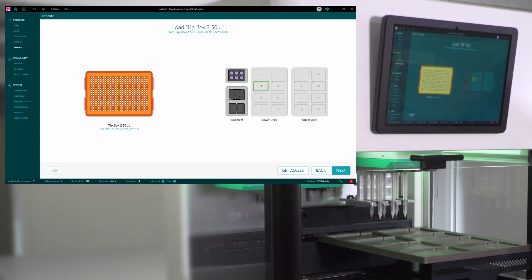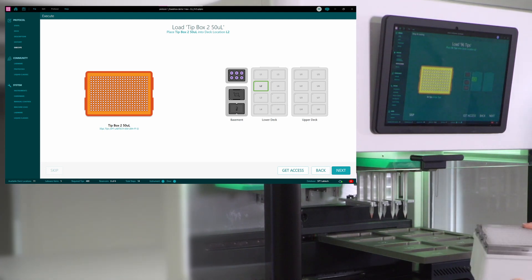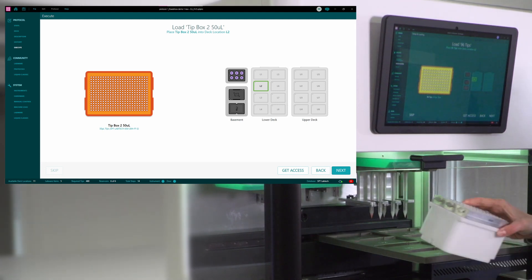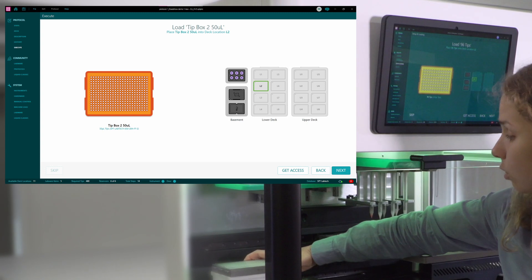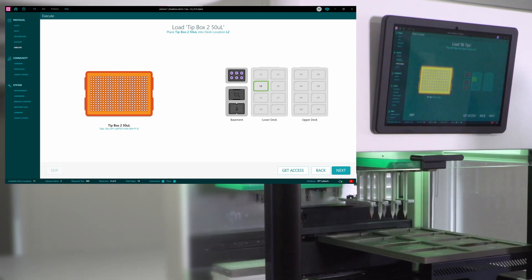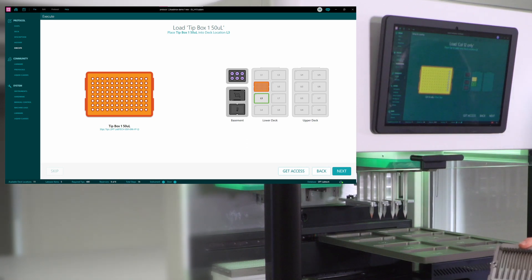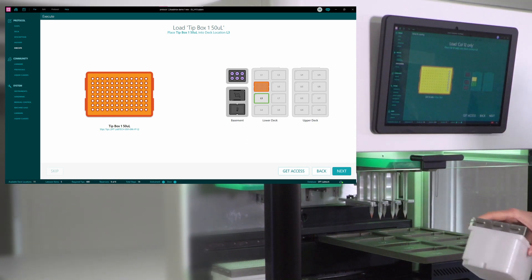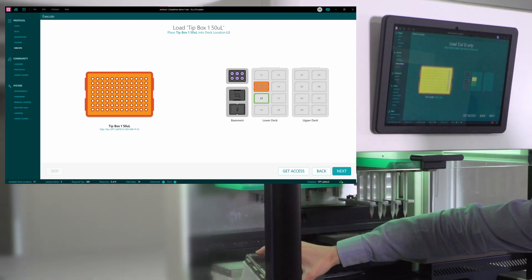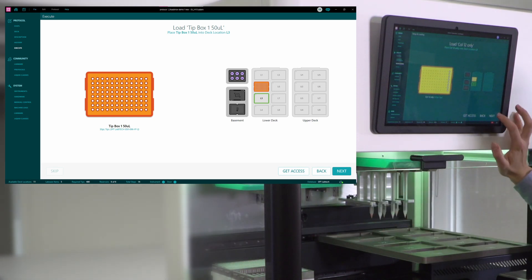So the first item that goes into the deck is the set of 96 tips. It's an array of tips, and it goes into the position L2 on the lower deck. Next, I'm loading another set of tips. This time is a strip tip, and it's going into position L3.